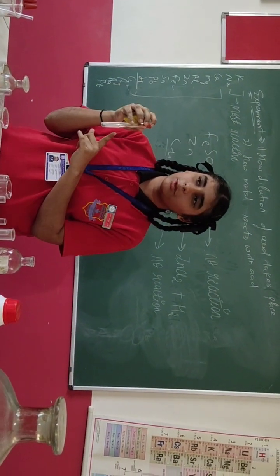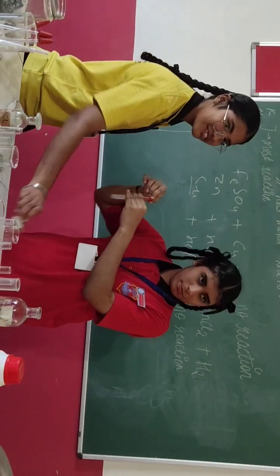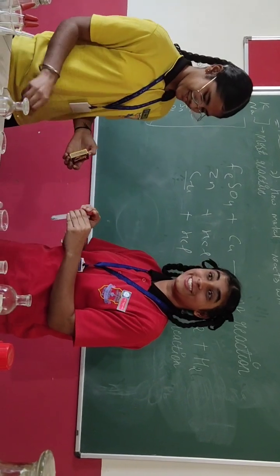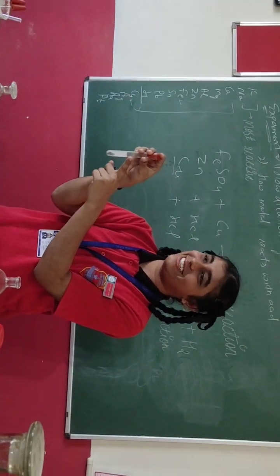Then I will show you the hydrogen gas. Here we can say that hydrogen gas is there.